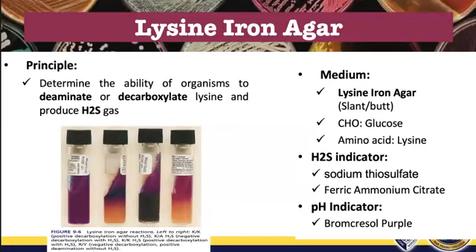So it is still a yellow butt. Because in TSI, the hydrogen sulfide production occurs in acidic environments, while in LIA it usually occurs in alkaline environments.